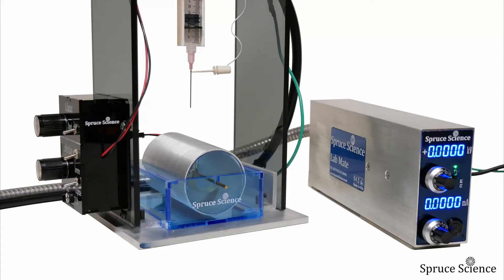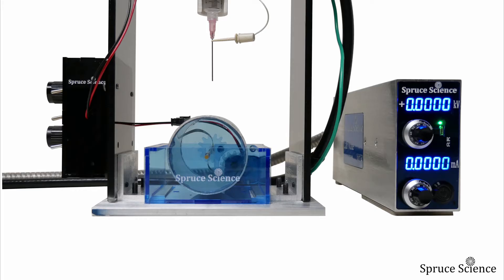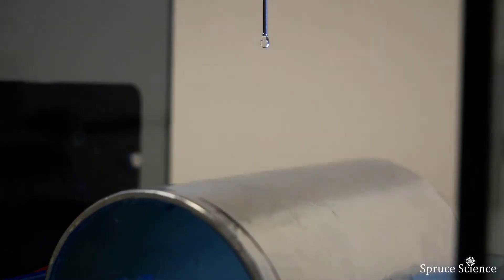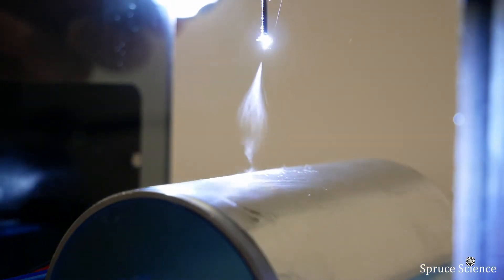Electrospinning is the method of using high voltage to produce ultra small diameter fibers. In the electrospinning process, a polymer solution is held inside a syringe needle pump.